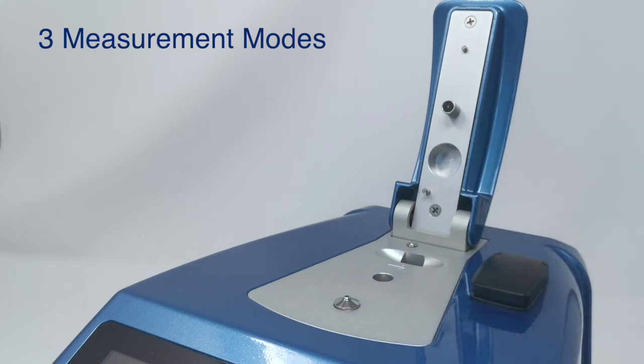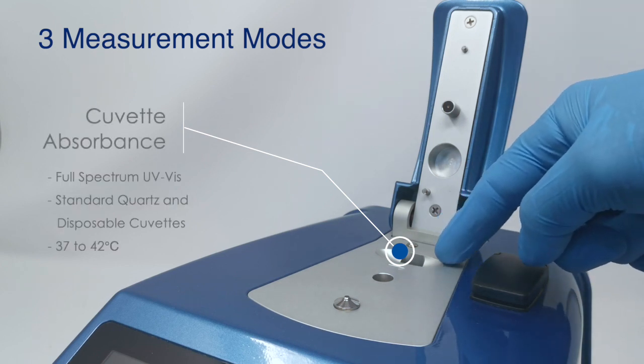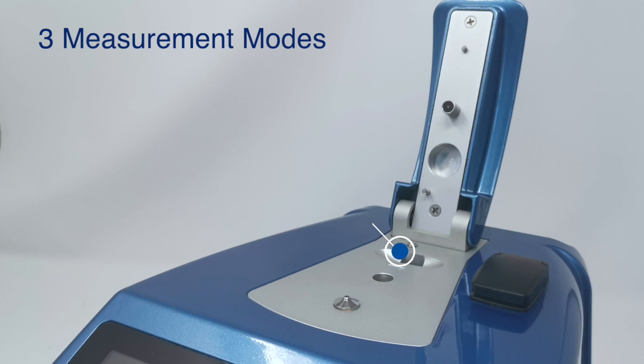We also have cuvette absorbance — again this is full spectrum UV-vis. This is a heated position so it takes all standard cuvette sizes and can heat from 37 through to 42 degrees Celsius. Commonly people are using this for biochemical assays, kinetic assays, but also for things like OD600 measurements for quantifying microbial cell cultures.